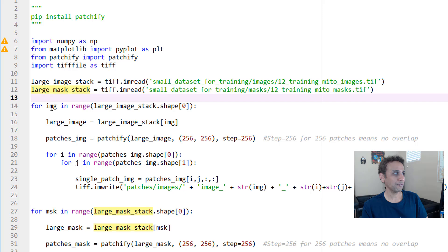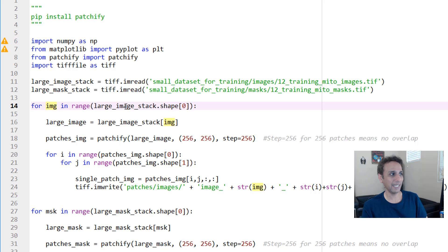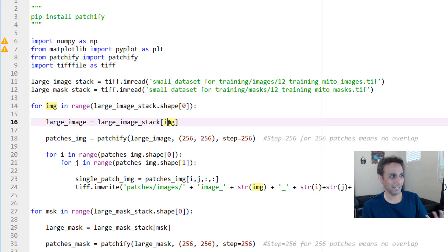Now I would like to go through each of these 12 images and then cut this 768 by 1024 into smaller patches. That's exactly what we are doing in this part of the code. For each of these images in this large_image_stack.shape[0], we are assigning my large image as large_image[0], large_image[1], 2, 3, 4, all the way to 11 to get all our 12 images.